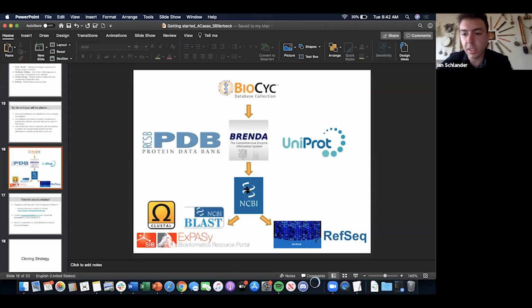So then we wanted to start messing around with the sequence and analyzing more. So we went to NCBI, and we took the exact sequence from GenBank using the RefSeq tool that you can now put into your SnapGene, in case that's the enzyme that you do choose. But tracking back, we first went to NCBI BLAST, and that's where we aligned the different enzymes, so that we can look at all the different enzymes that we wanted.